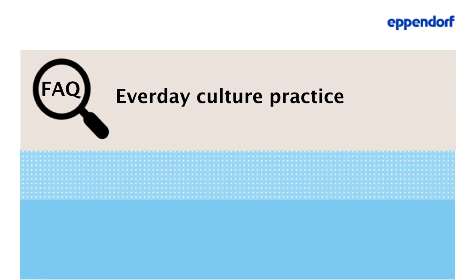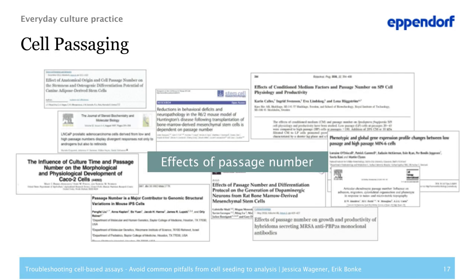Our next topic is everyday culture practice. The passage number of cell lines has often been described to influence cellular behavior. The passage number is a record of the number of times the cell culture has been subcultivated. There are numerous studies giving evidence that passage number affects a cell line's characteristics over time — including alterations in morphology, response to stimuli, growth rates, protein expression, and transfection efficacy.